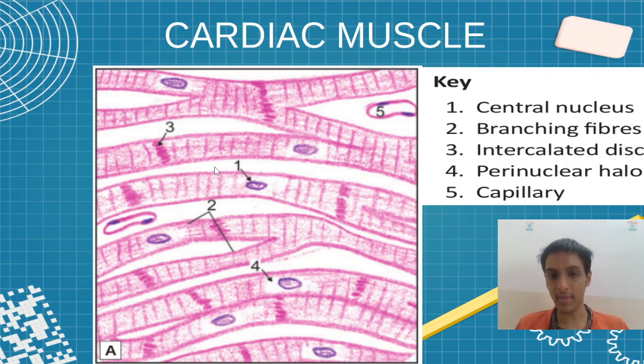Let's go to cardiac muscle. So if we understand skeletal muscle and cardiac muscle, we'll just compare now. So in comparison with skeletal muscle, this is branched. It is also cylindrical and nucleus is at the center. There it was periphery in skeletal.